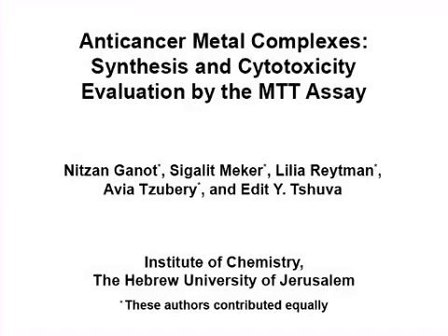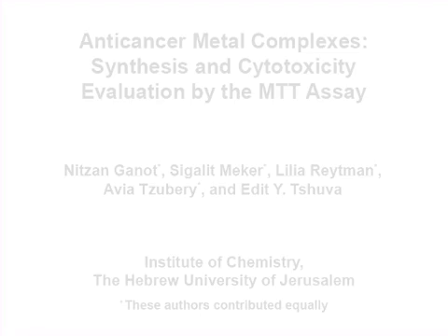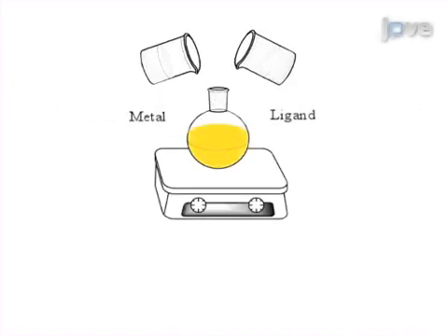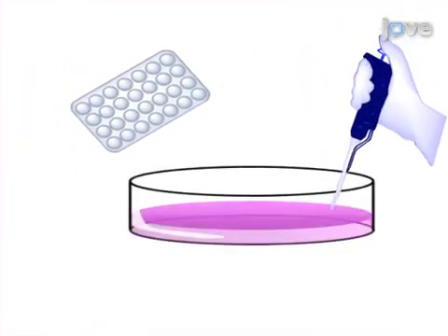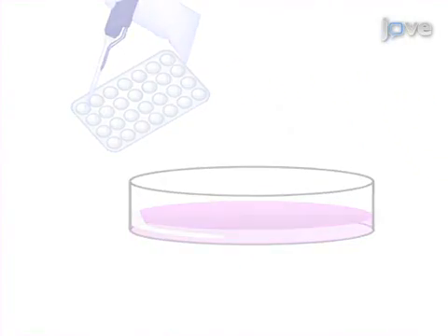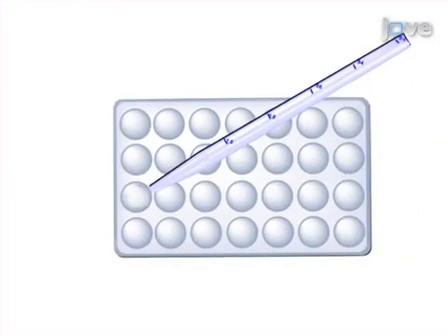The overall goal of this procedure is to prepare anti-cancer metallodrugs and evaluate their cytotoxicity by the MTT assay. This is accomplished by first synthesizing metal-based anti-cancer compounds. The second step is to prepare 96 well plates of cancer cells. Next, the metal-based anti-cancer compounds are inserted into the cancer cells.